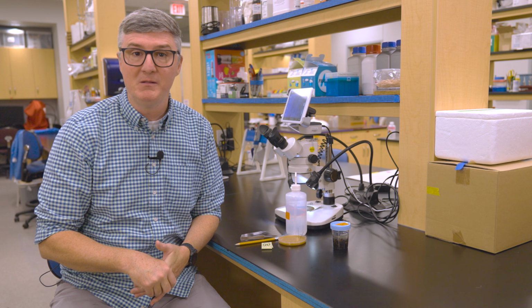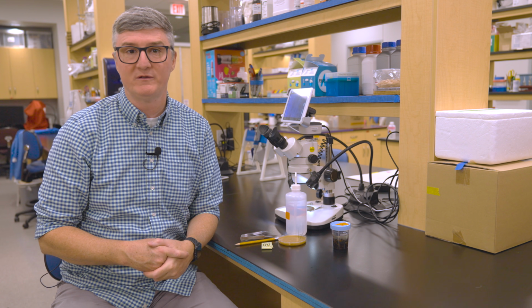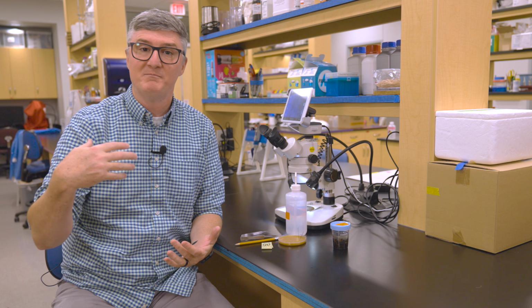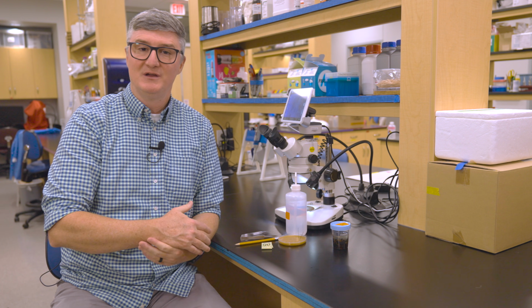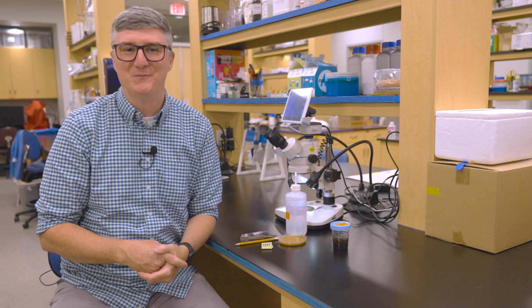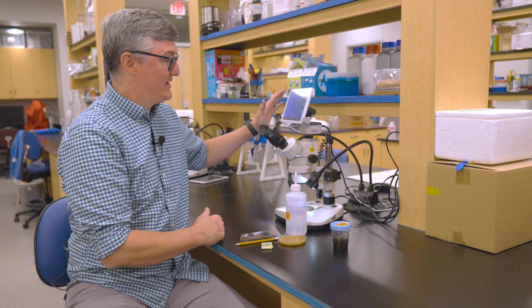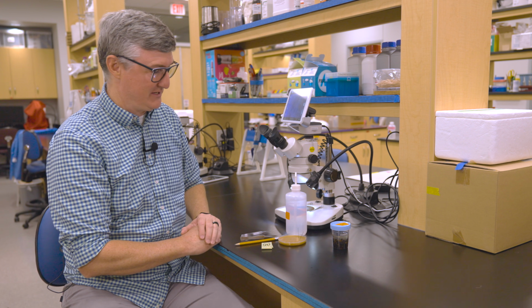If that's a problem, you might consider talking to your local bee club into purchasing one of these dissecting microscopes so that it's available for you to use or for members to check out. It's a great resource to have, not just for dissecting bees for tracheal mite purposes, but also for just looking at how beautiful bees are in general. So now that you've got this microscope and a fancy gooseneck lighting system, everything else is actually pretty easy.